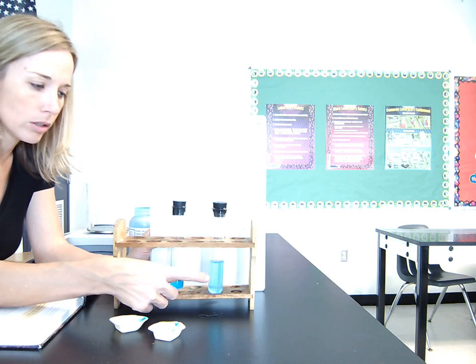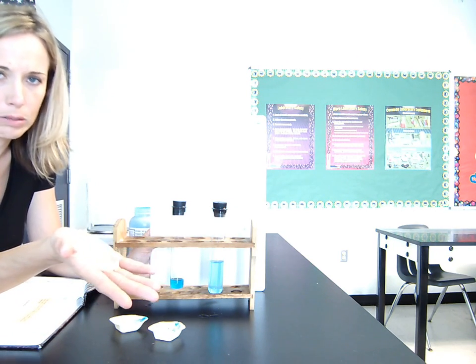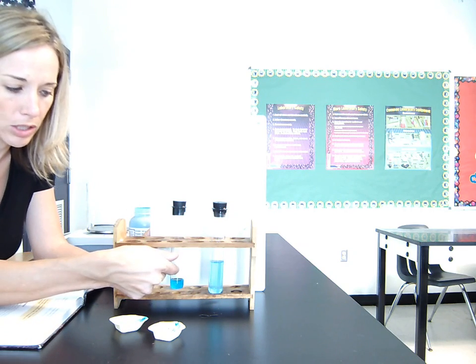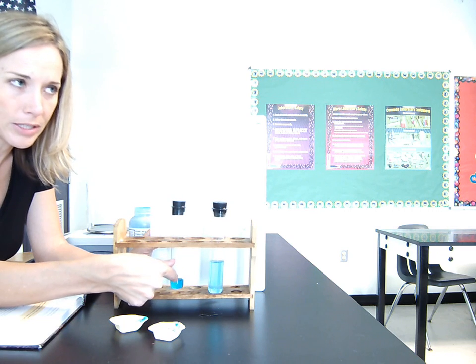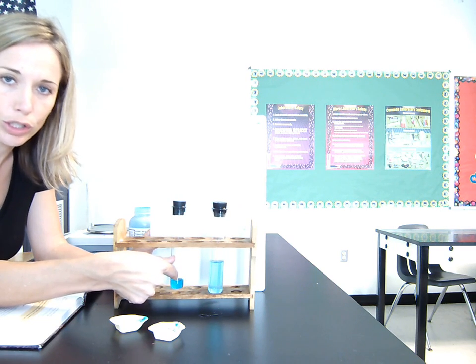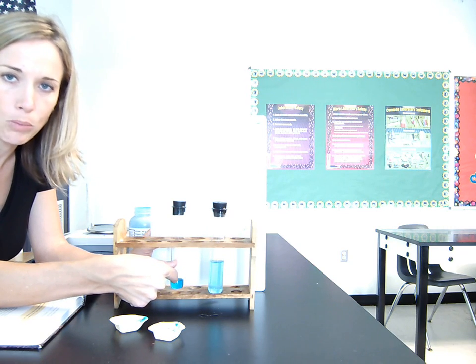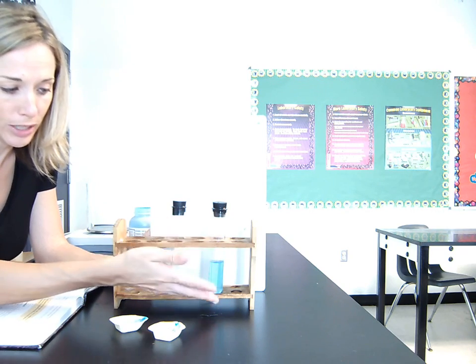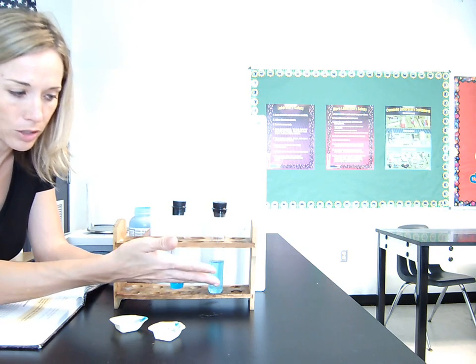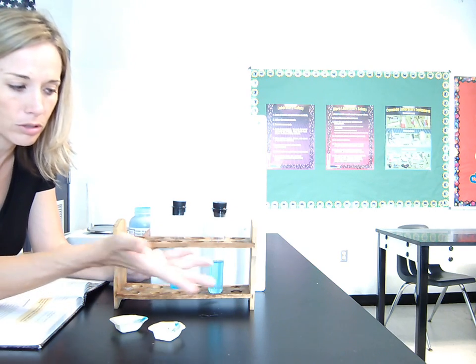Well, you can tell pretty clearly that this one is darker than this one, which again seems logical, whether you know how to explain it or not. I mean, we would expect this one to be darker. The reason is this one has less water, so there's less substance for the blue stuff to dissolve into. So it doesn't spread out nearly as much, so it's going to be darker. We call that being more concentrated. This one is more dilute. Dilute means it spreads out throughout a much greater amount of liquid. So the blue particles have a lot more room to spread out, so the color is going to be lighter in shade.